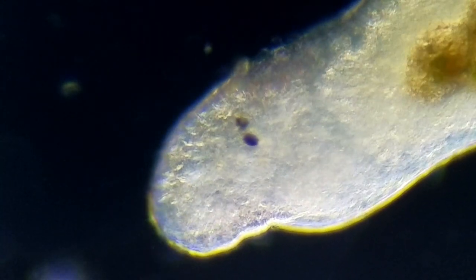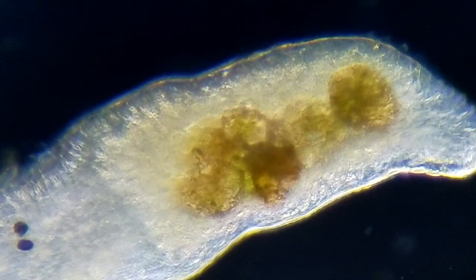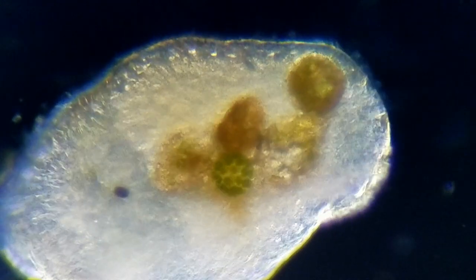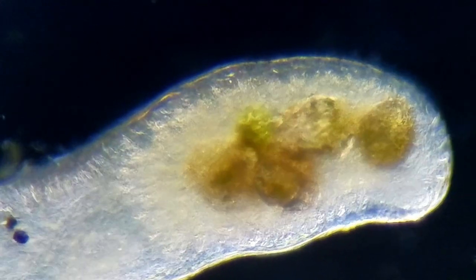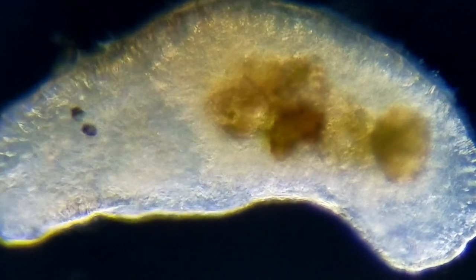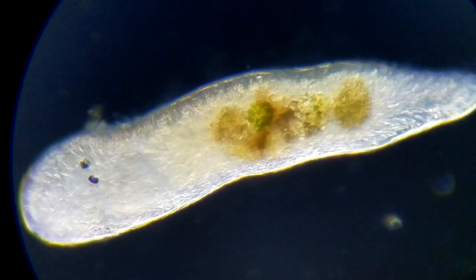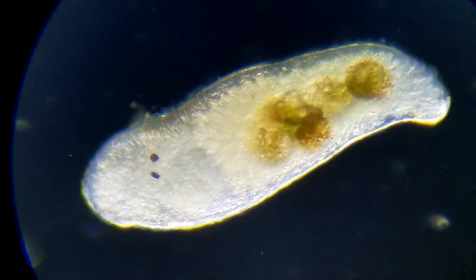Now this is a flatworm — reminds me of Casper the friendly ghost, with two holes cut in for the eyes. Flatworms are very interesting because they have a great ability to regenerate, a little bit like the hydra. If you cut this flatworm into a hundred pieces, guess what — he'll grow into a hundred flatworms, even regenerating his brain. Inside him you'll see what looks like maybe a diatom, that green right there, and the rest may be algae and other things he has consumed. The food in him just rotates around in a circle. Even their brains regenerate — scientists study that to try to help people with strokes and other things.